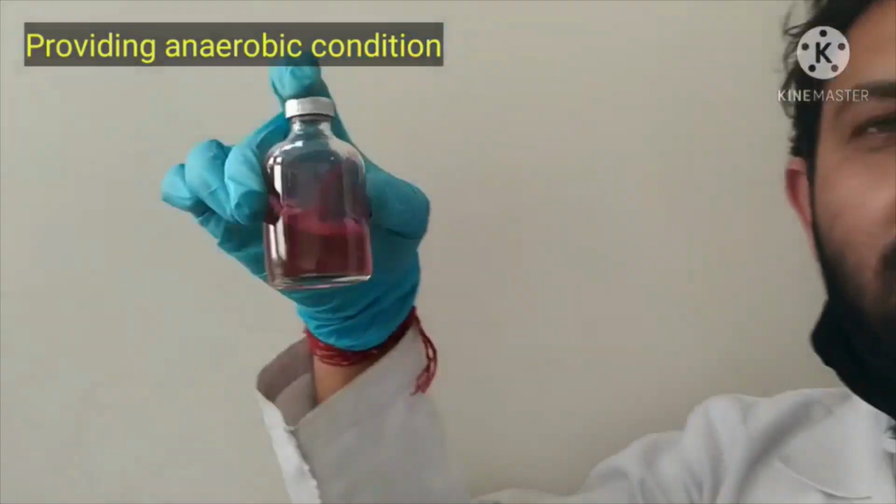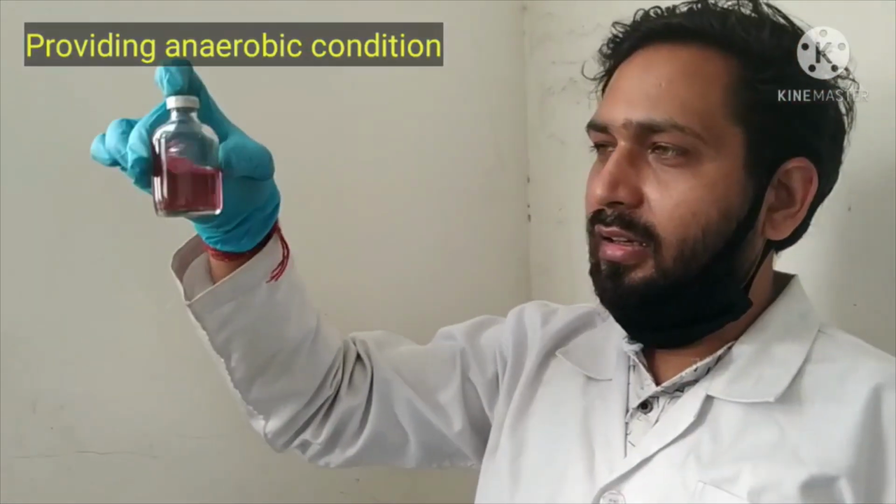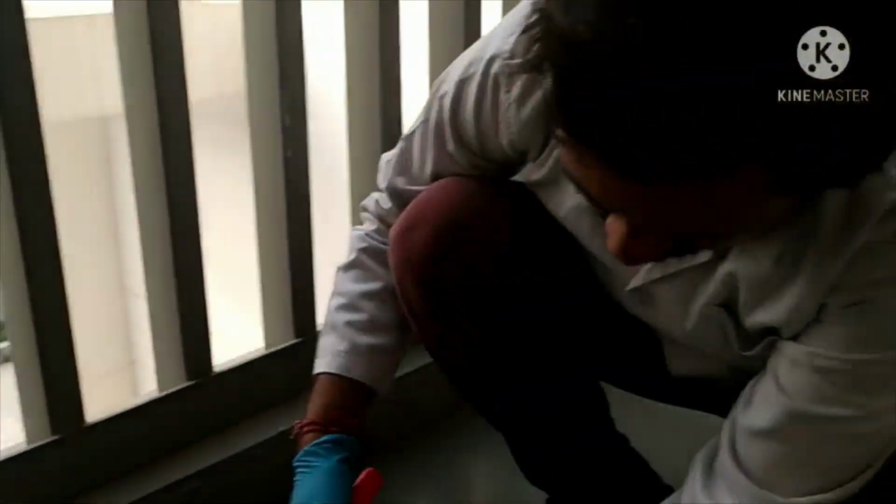Now you can see the resazurin showing a dark red, pinkish red color, so it is showing that the condition is not yet anaerobic. When we provide anaerobic conditions by purging CO2, it should become colorless, showing that the condition is totally anaerobic. So we will purge the CO2 here, and then we will see the color.